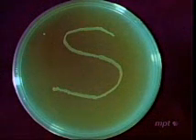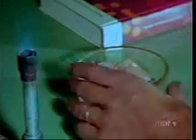Staphylococcus epidermidis is a bacterium which can be easily cultured on nutrient agar. Penicillium notatum, a mold commonly found on fruits and cheeses, also grows well on agar. How will the two species behave in competition?